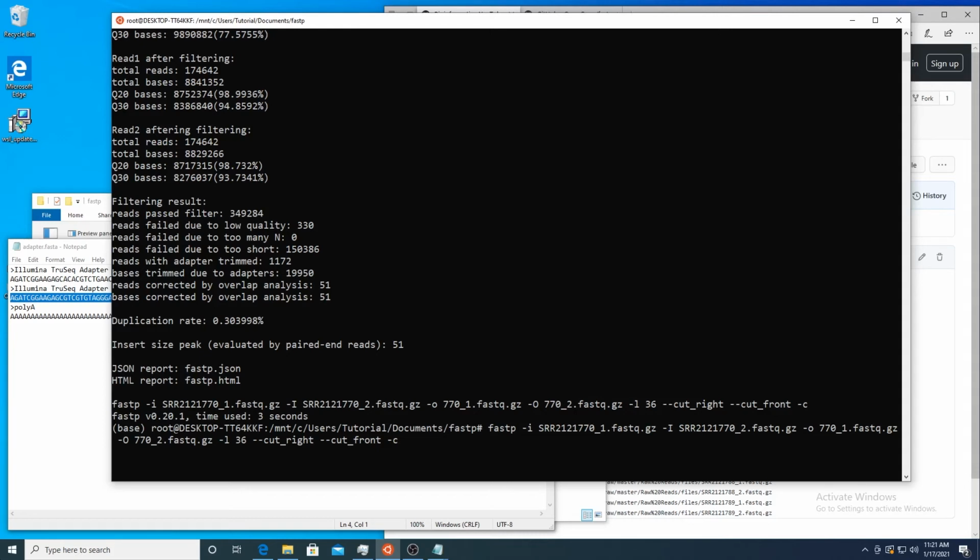Next, fastp has the ability to process UMI on reads, so unique molecular identifier on reads, but I've never done any UMI index reads. From my understanding, each read has a unique identifier, which then allows you to trace it back to its origin or reads from the same molecule.